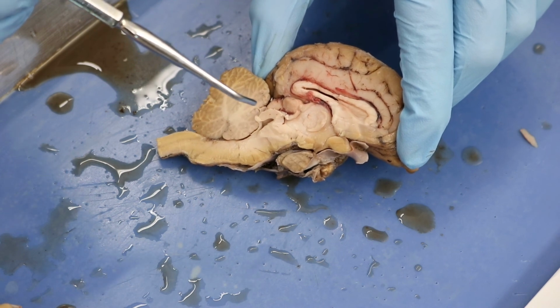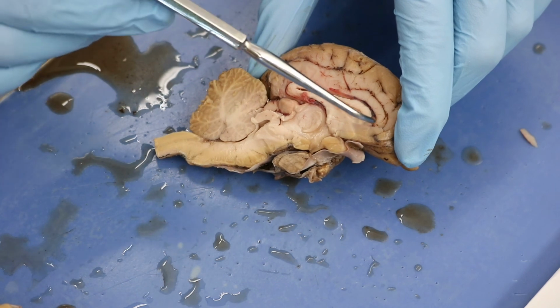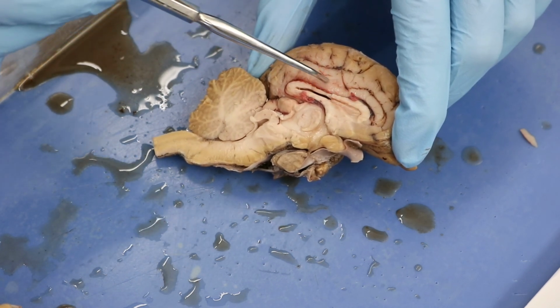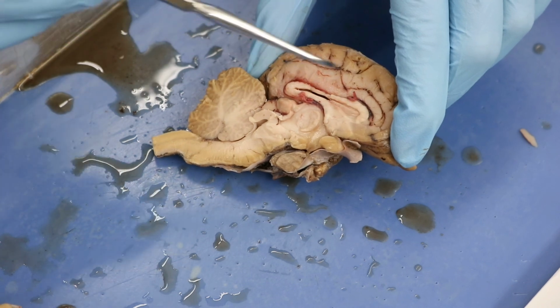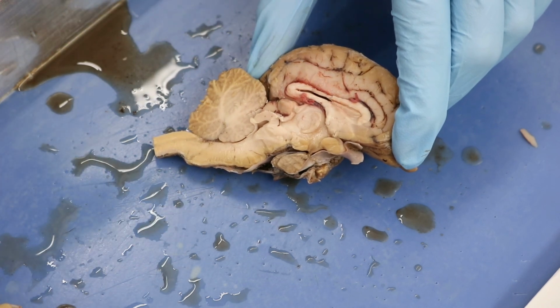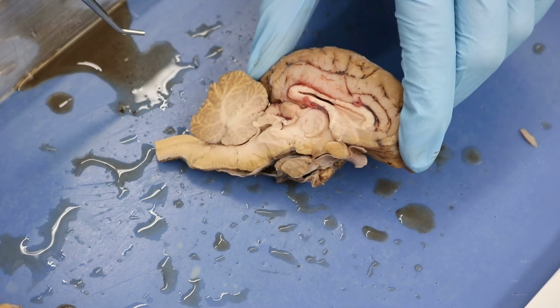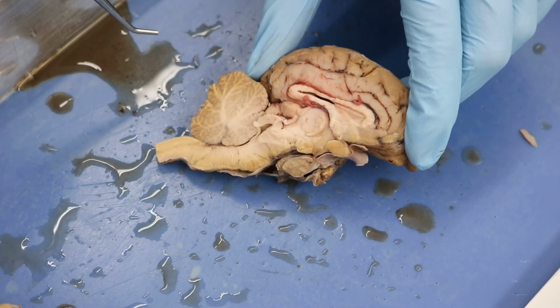I think, oh, we did. Cingulate gyrus, okay? Cingulate gyrus is right here. And we got everything else. So that is everything that you need to know for the sheep brain dissection.